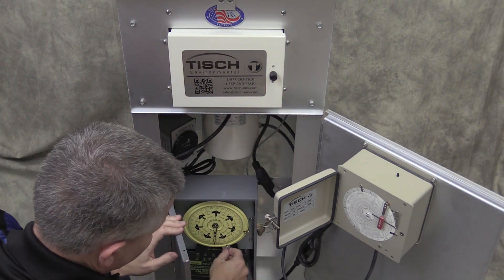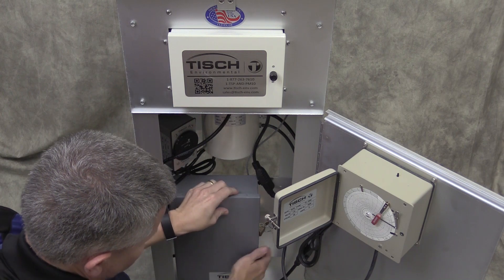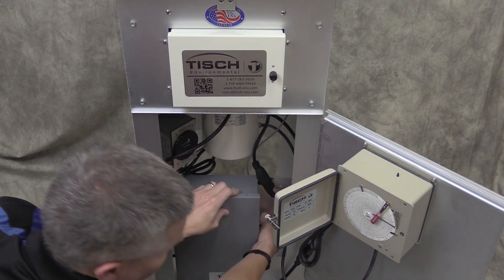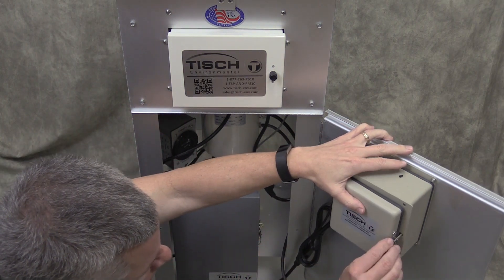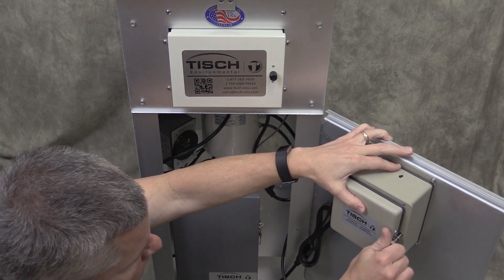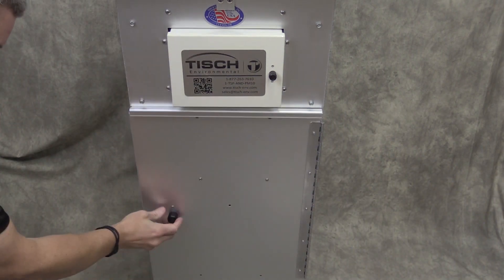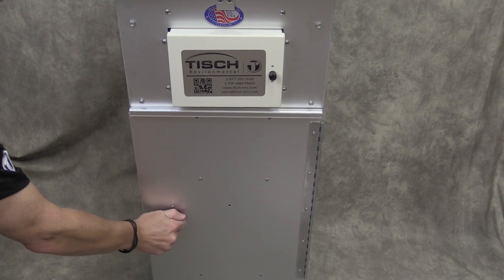Turn the system off. Close the door of the timer. Close the door of the recorder. Store the pen cap for later use. Close the door of the sampler. Now you are ready to run.